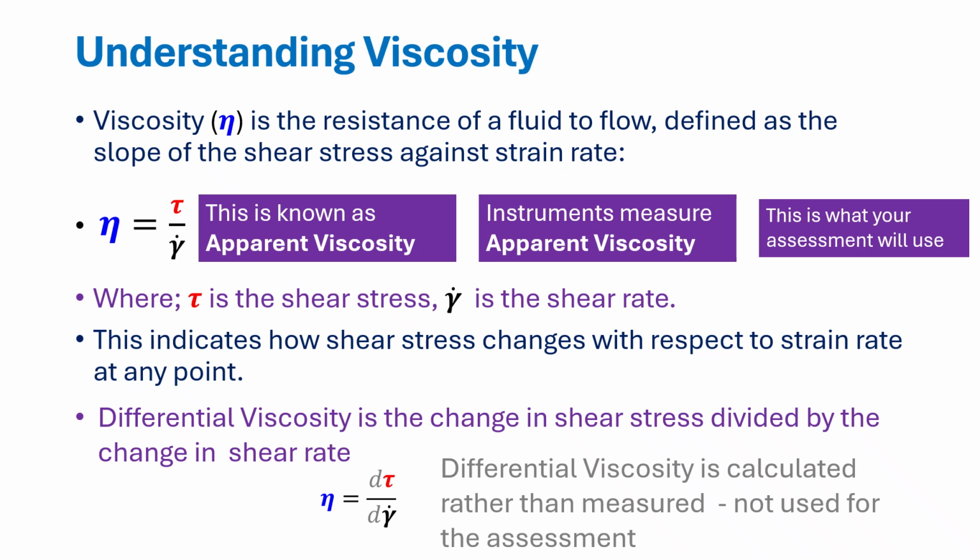And that's normally what the instrument measures. It's known as the apparent viscosity. It's what this assessment will use. It's what we get out from our instruments. So again, please don't get worried about this.